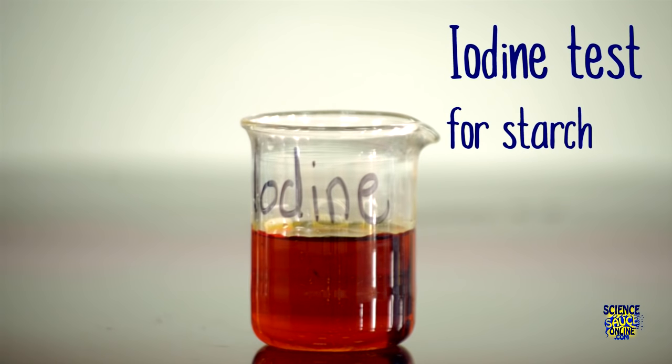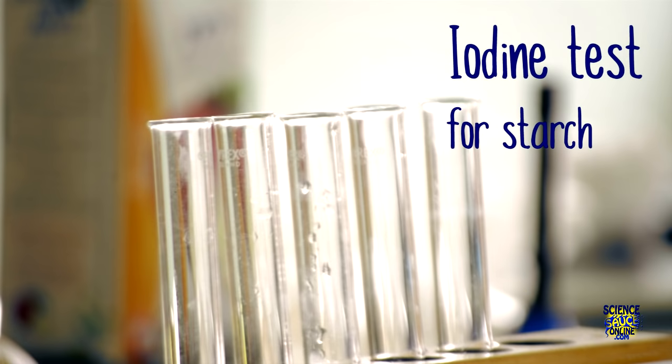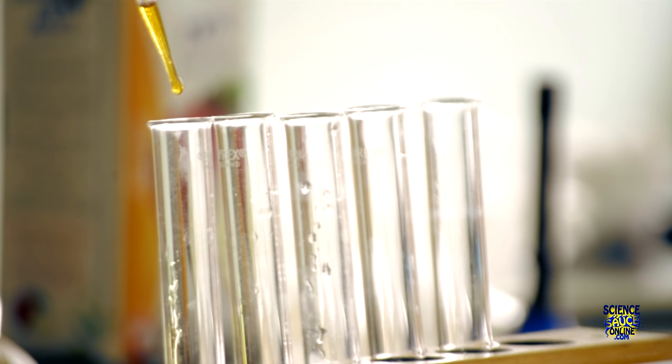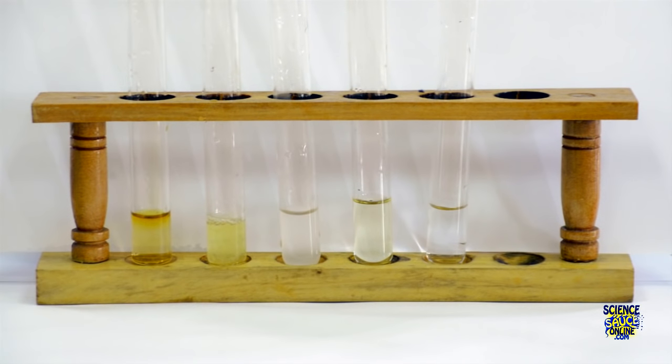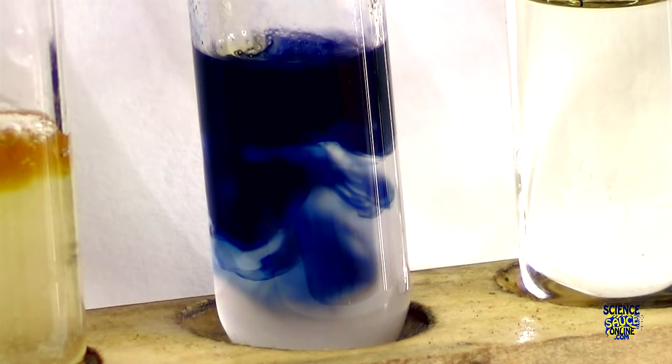Let's start with the iodine test which is the test for starch. First take your iodine solution and add it dropwise to each of your samples. Notice that the iodine is a kind of orangey color and when we add it into our samples that orangey color remains until we add it to the starch solution and there's a clear blue-black change in color.